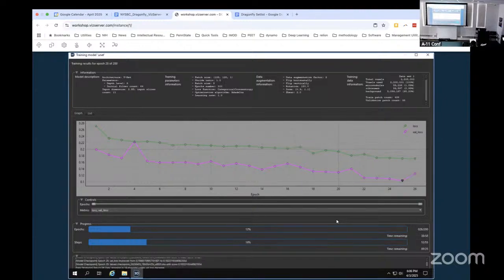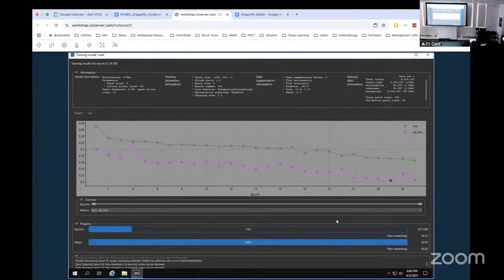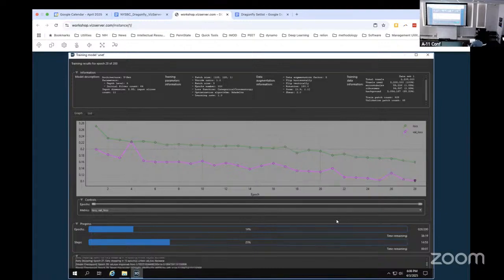You just have to let them know once a year that you're still using it academically. It's software only. We do electron microscopy, serial sections, and we've been looking for a tool that would help us segment out the inside of the cell. I have a student who graduated and works with Thermo now. That's her job, really.